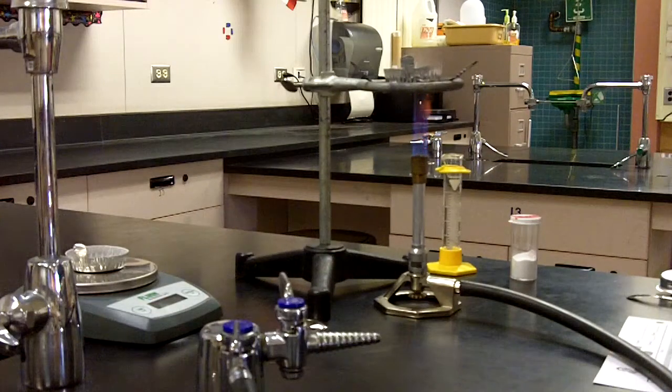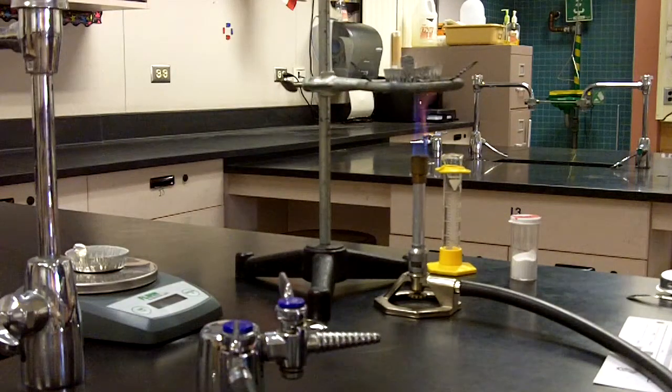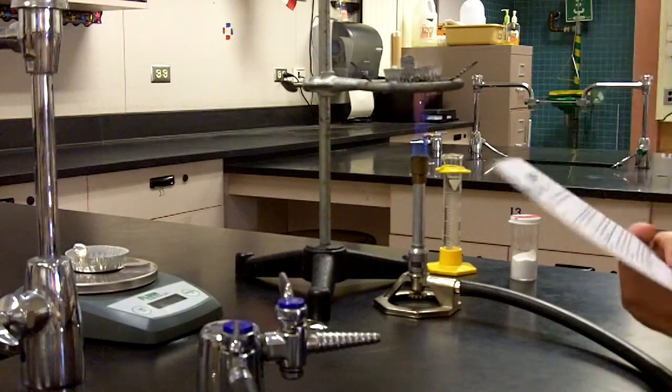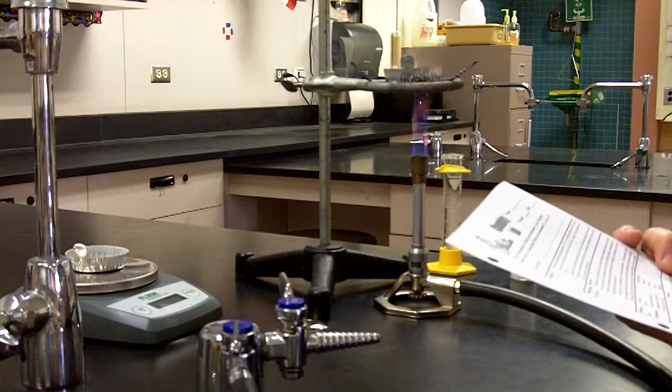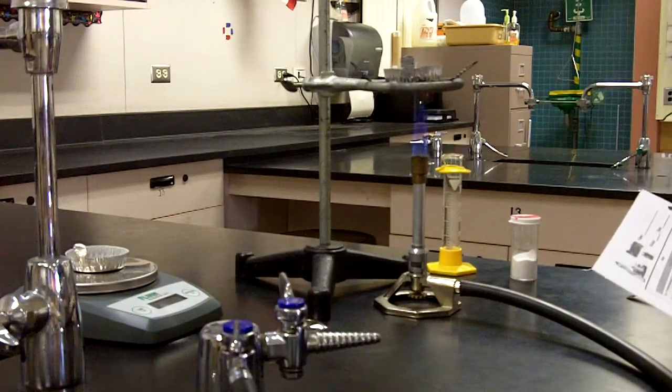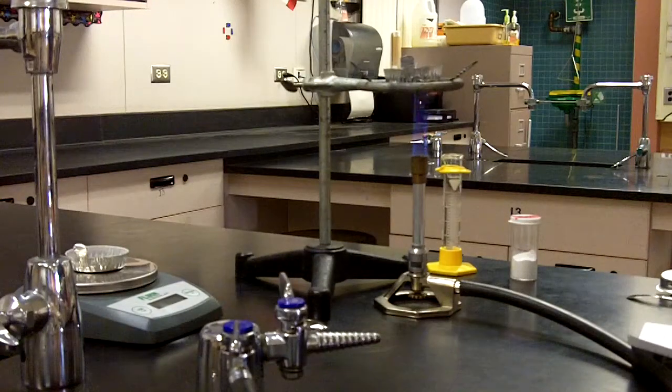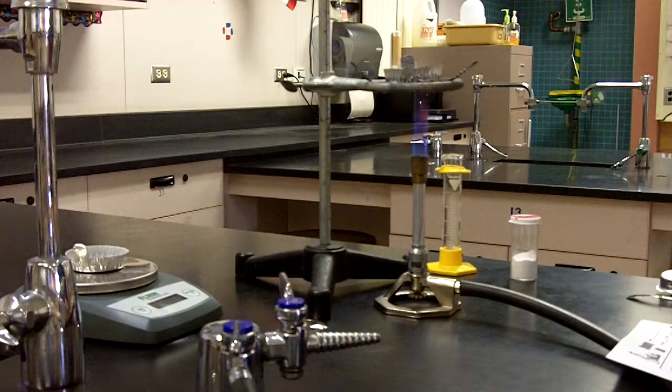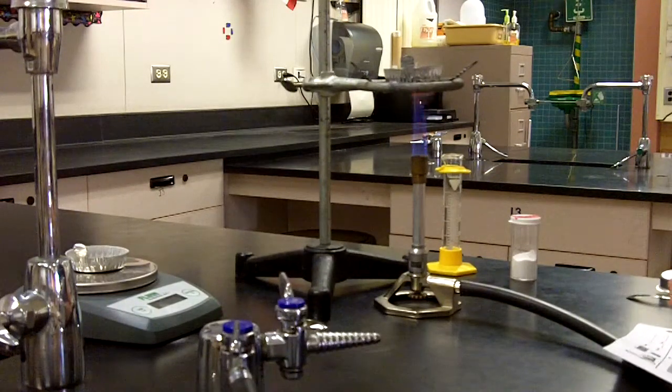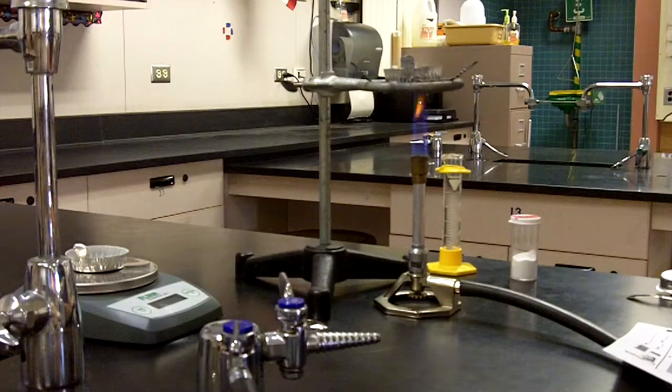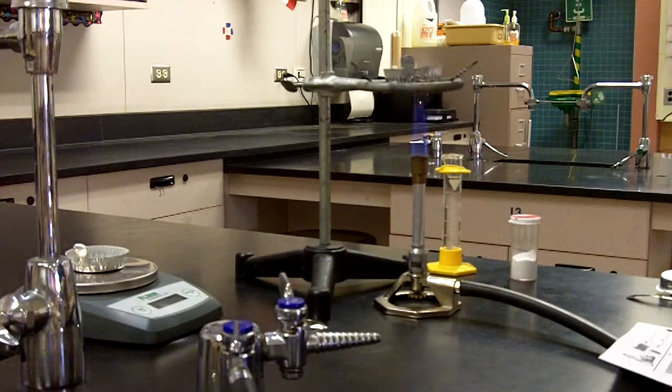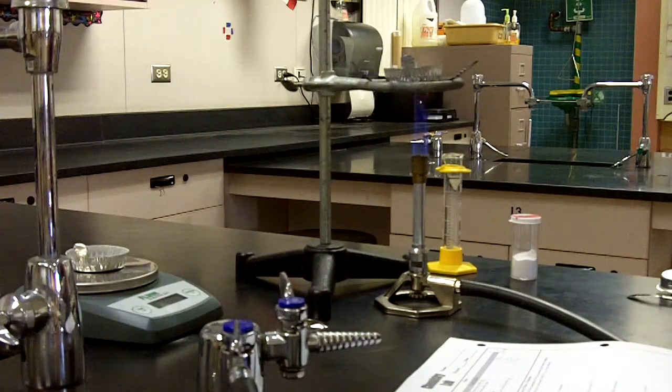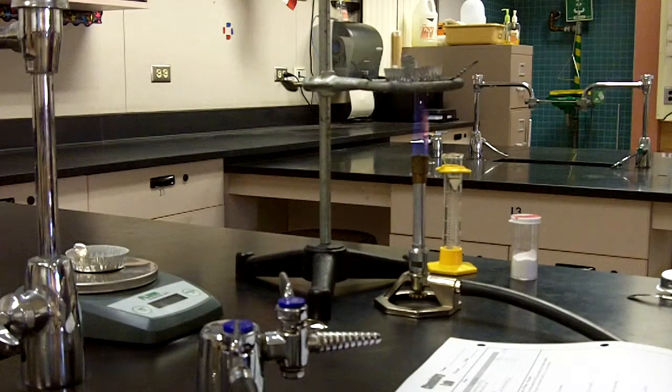So here we have our dry watch glass. This measures 2.0 with the solid product. This watch glass here, prior to putting in the baking soda, had a mass of 1.3. And that 1.3 is going to be the value of just the evaporating dish. So please write 1.3 to the right of where we have 1.4, put it in parentheses. This will make it obvious that you were watching the video.